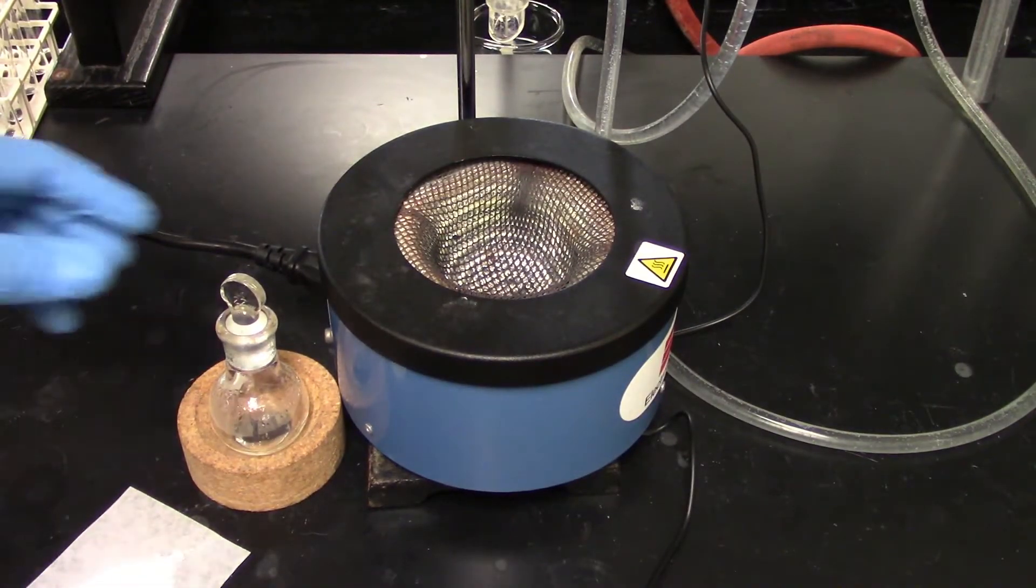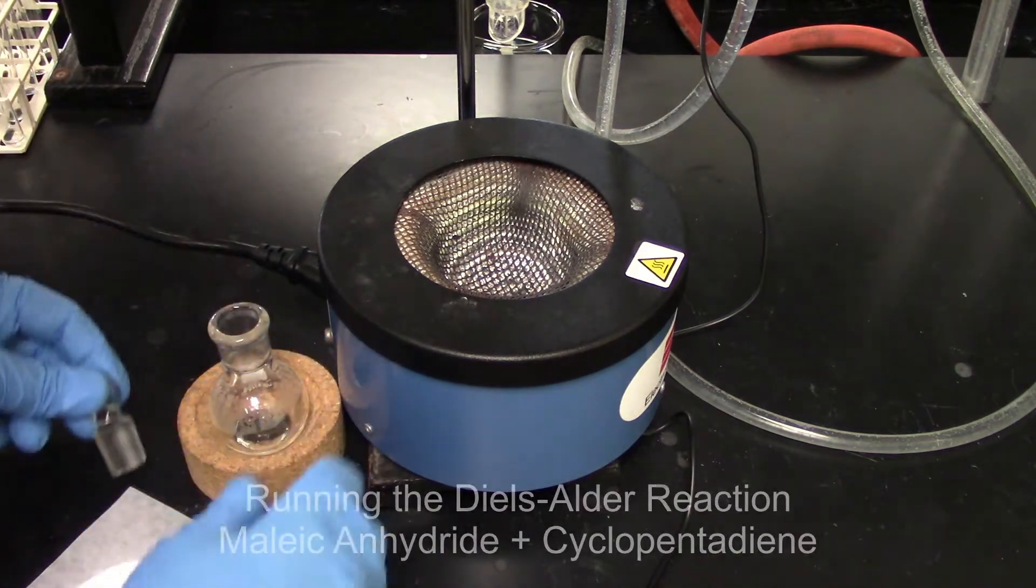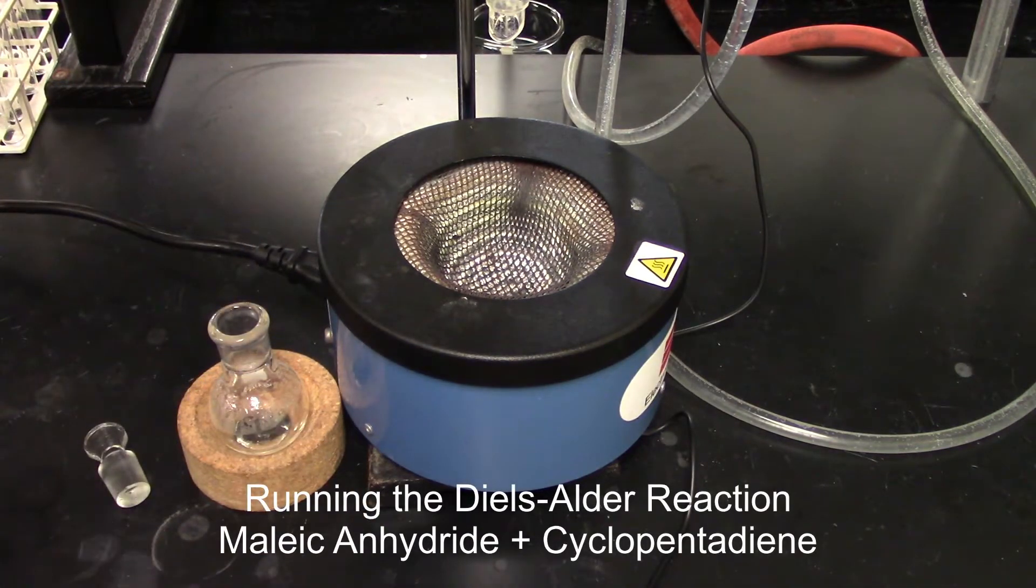Alright, so my material is cooled down. Now what we're going to do is add the maleic anhydride, and this is going to be acted on by cyclopentadiene.